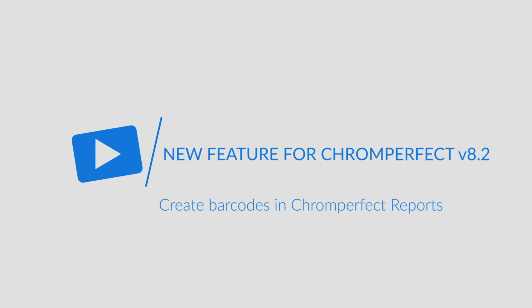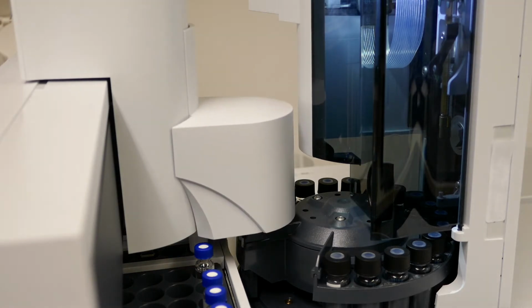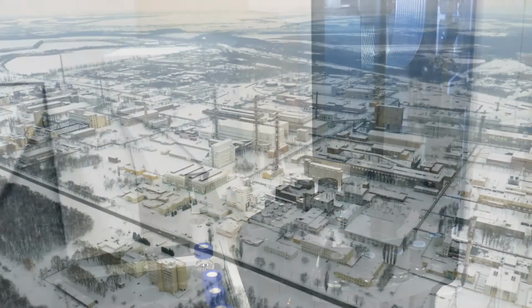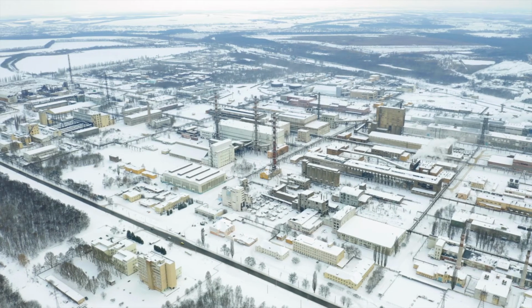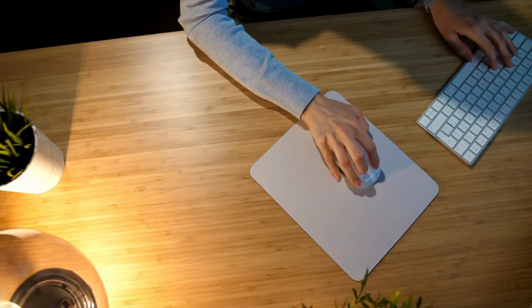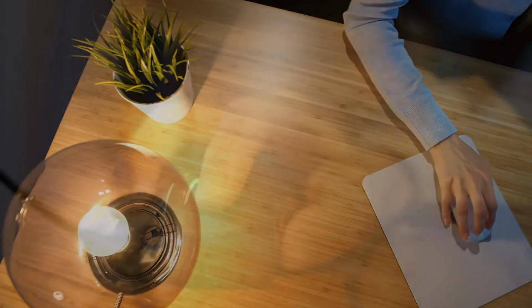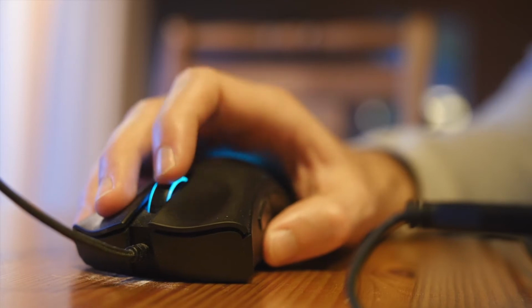Automation is extremely important in modern chromatography laboratories. Chromperfect supports many features and tools which allow data to be shared across the entire organization seamlessly and automatically. However, many organizations still manually input data from their chromatography data systems to third-party software. Until now, this has been a time-consuming process, and manual data entry is subject to human error.